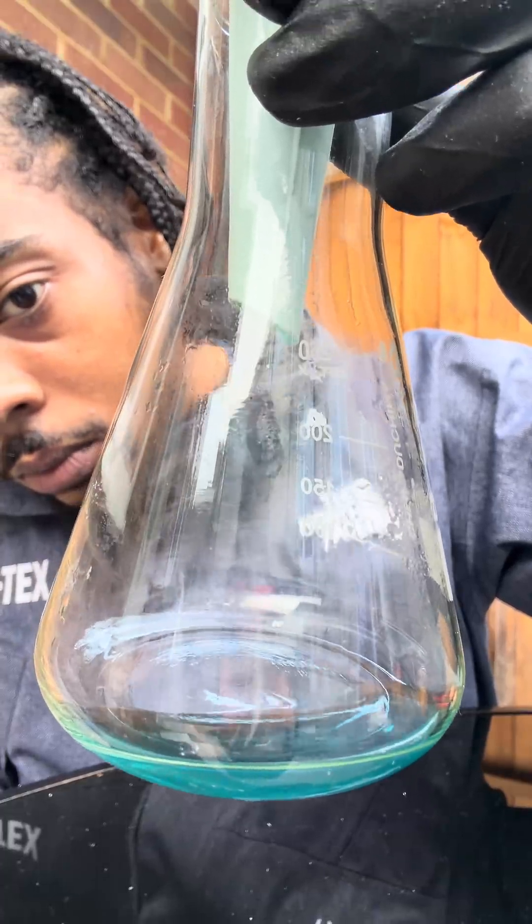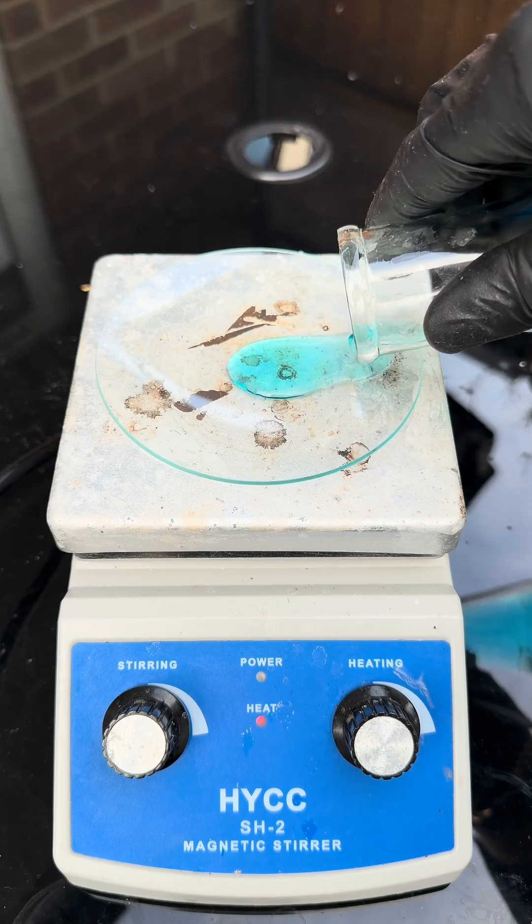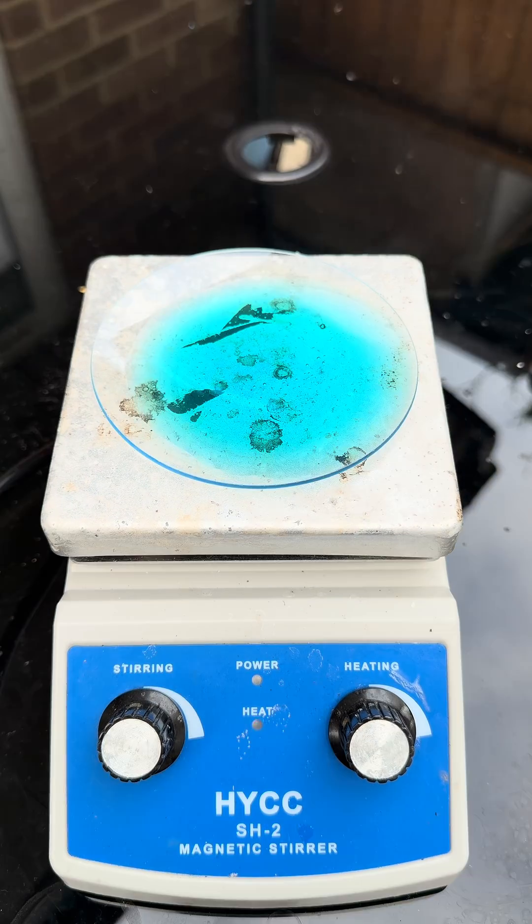Look at that — blue ting straight away, fam. Copper sulfate settings. Then after that, we're going to heat it up on a hot plate.